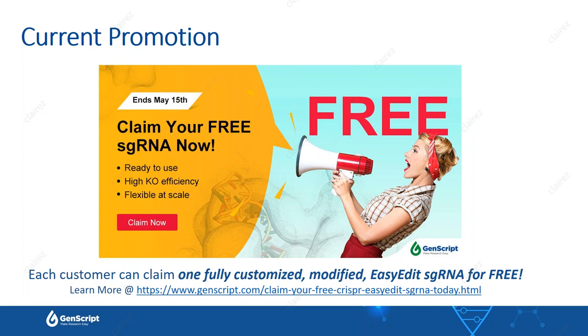Another question, can we use this method for base editing? If you wanted to base edit, again, that is a very different kind of Cas9 protein. It is highly modified, so that would require substantial changes. Another question about the best method to deliver RNP. Yes, from some papers we've seen, electroporation is the most effective method for introducing RNP in cells and also for some in vivo studies.